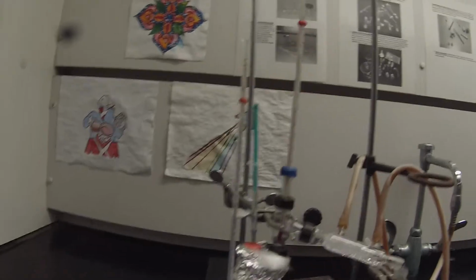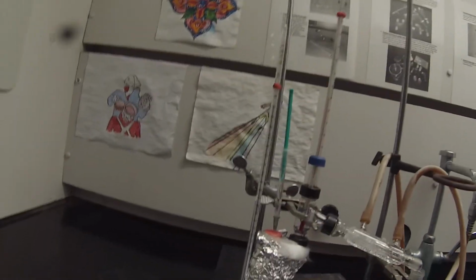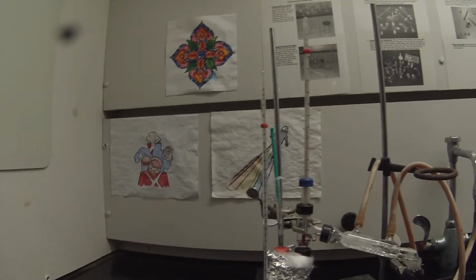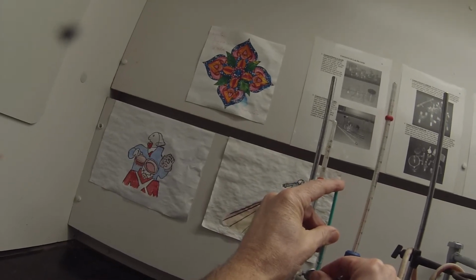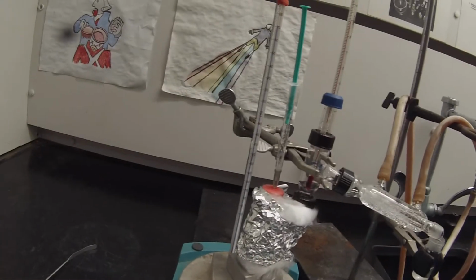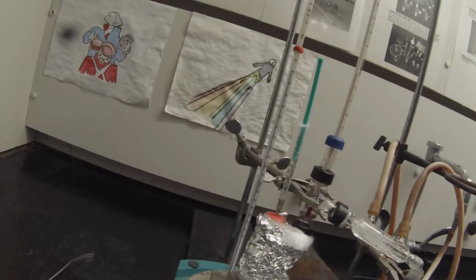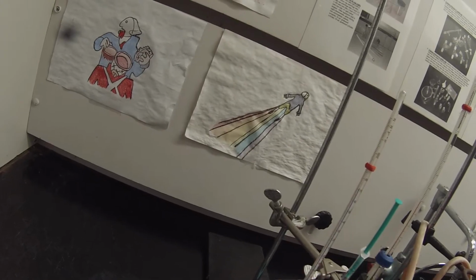We're up to about 30 here, so I think we might actually be starting to drive over some liquid. We'll add another half. Taking us to the 0.8 mark on the syringe, so about 2.5 milliliters. Yeah, it's a little hard to tell, but I think I might be seeing a little bit of a drop of liquid on there. We're nice and stable. We're at about 171. That's enough.